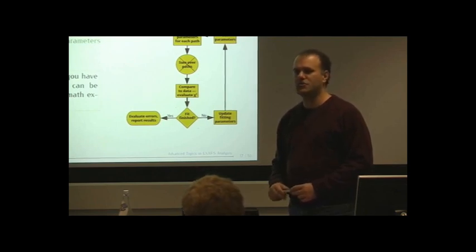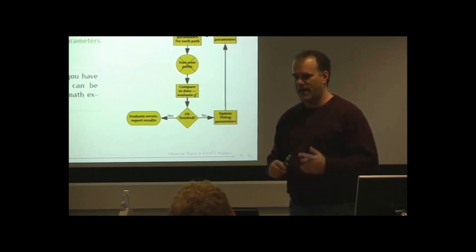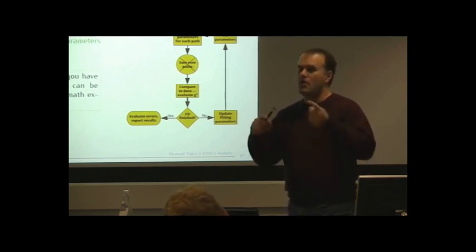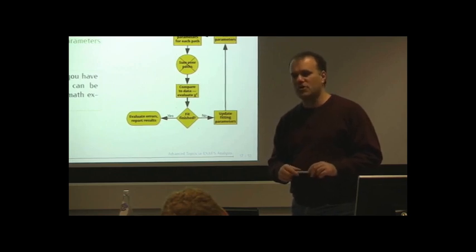What it means is that every time you run a fit, and every time that IFFIT reports error bars, it scales them such that if that was the fit you want to run with, those are the right-sized error bars. But whether or not that's the fit you want to run with cannot be determined, essentially because of the flaws in evaluating epsilon.